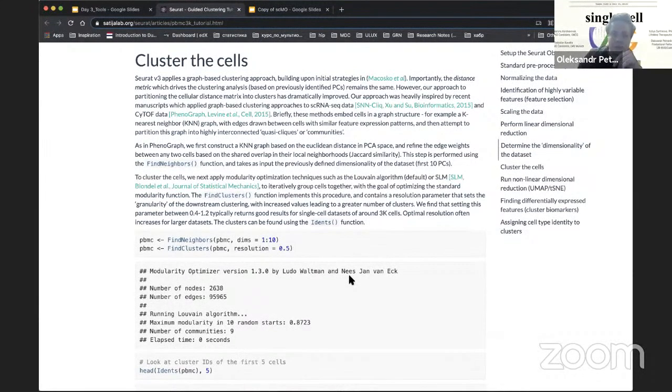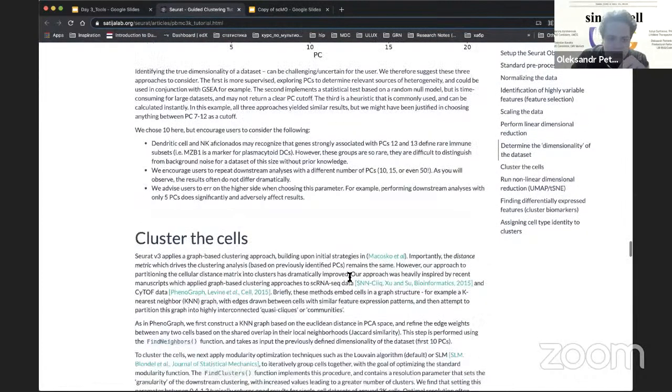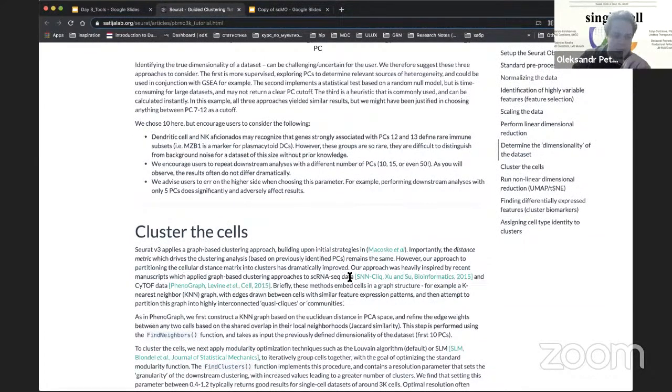And I know a lot of very smart people working on new methods, so there are a lot of those. And I think, which one do they use in this tutorial? You mean which one, PCA? Yeah, so they do PCA and also they do UMAP, right? Yeah, I think that's okay. We'll go closer to that point later.